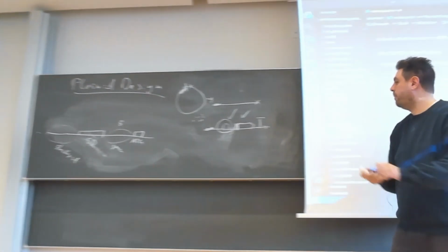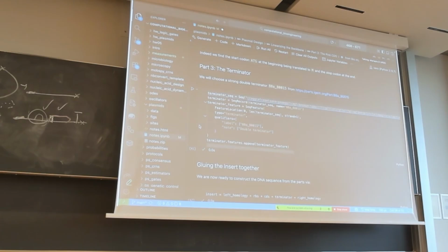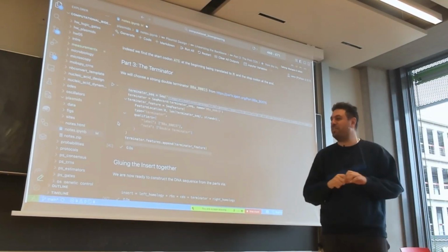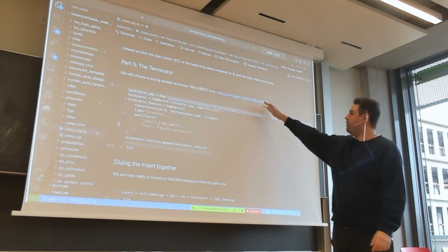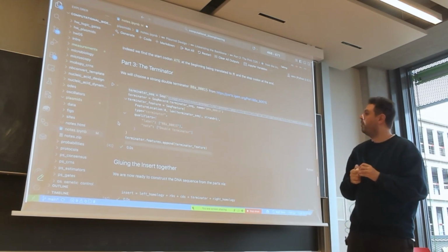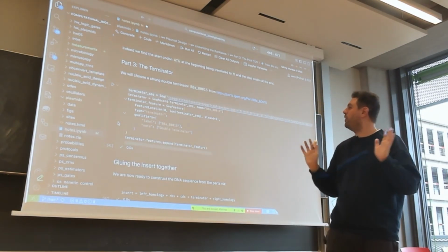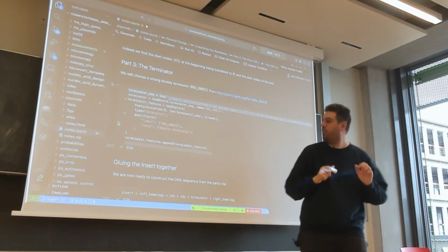Next is the terminator. For the terminator, we also look in the big library of the internet. In this case, I found a nice one in iGEM parts, which, by the way, was difficult to access because they are just reworking the library. So some of the links were stored, but okay, here it is. This is also a very famous terminator. It's a double terminator that is very frequently used. For some reason, I didn't find an API for iGEM that was working at this time. So here I really copied, shame on me, but we had to make it work. Here we copied the sequence, and here we annotated, and this is the terminator.